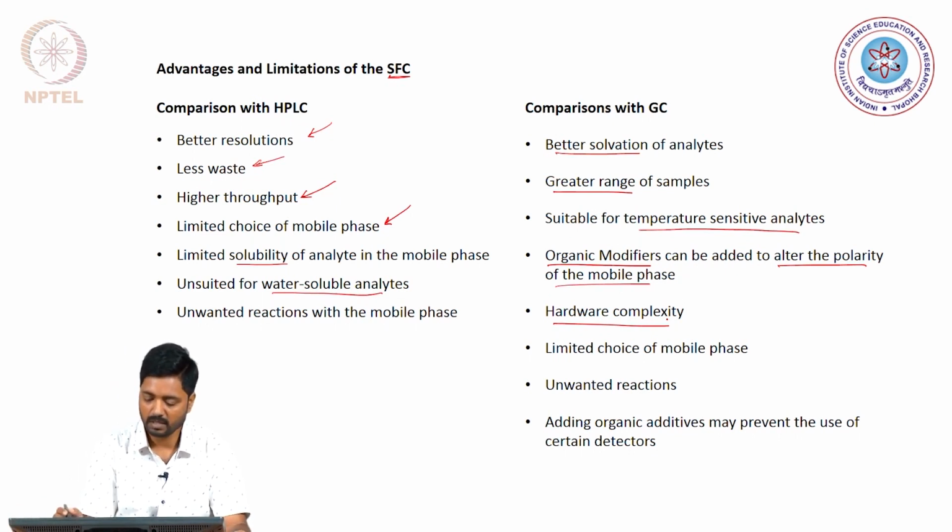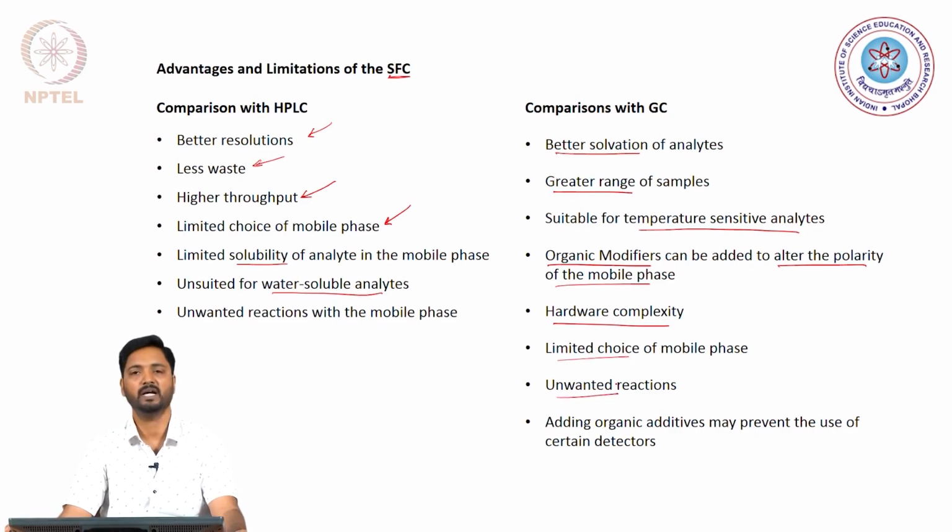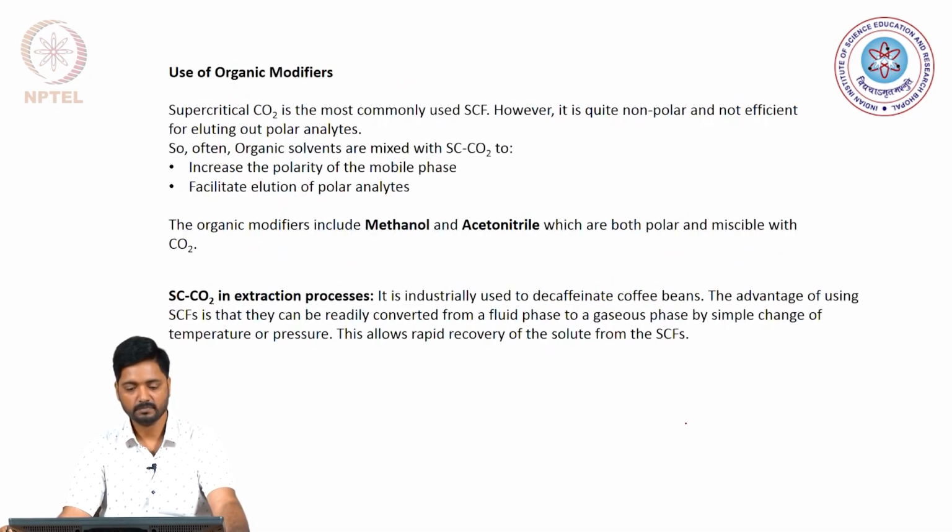Of course, the common challenges here are the limited choice of the mobile phase and the unwanted reactions that have already been discussed, and finally adding of organic additives to alter the polarity of the mobile phase may prevent the use of certain detectors.